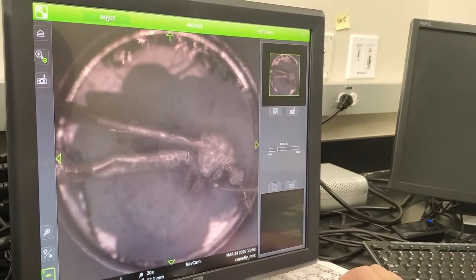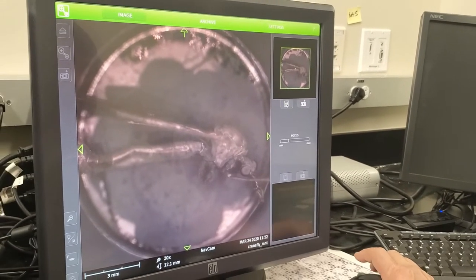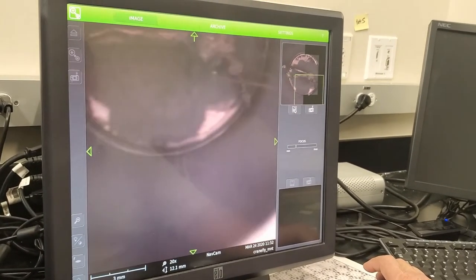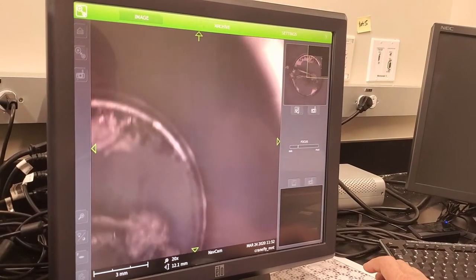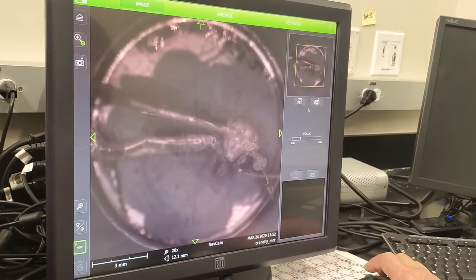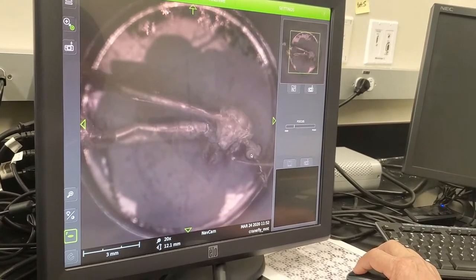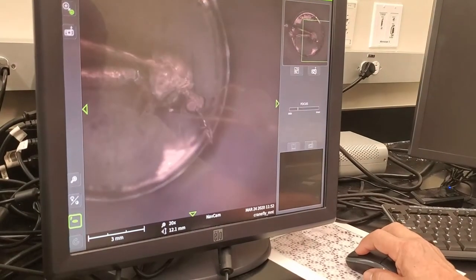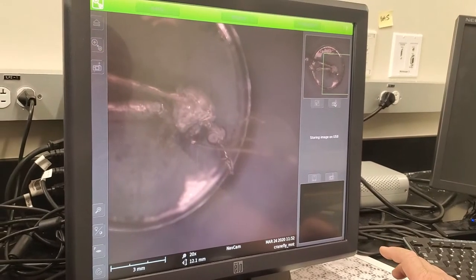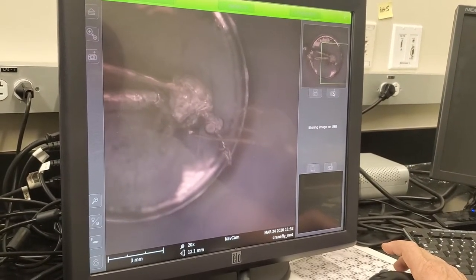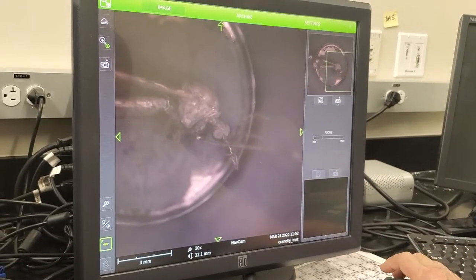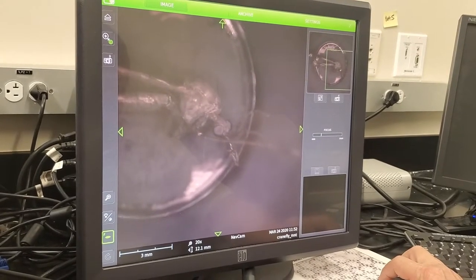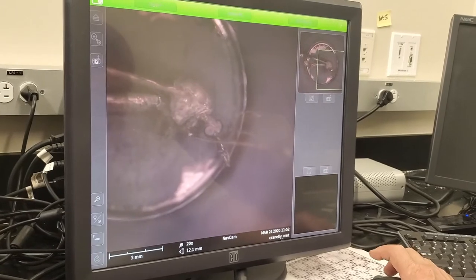Now what's the next thing? Map it. So you can see the crane fly — let's map it. Just want you guys to stay fresh with this. I'll send you guys a simulation later. Alright, so we got that. Let's look at the eye — I'm going to point at the eye and zoom in. Context picture: take a picture of the context where we are. Then we'll take the optical microscope picture. I'll leave it at 20x because you can see the eye, and the mouthpiece is right there. I already focused it, so take a picture of that.